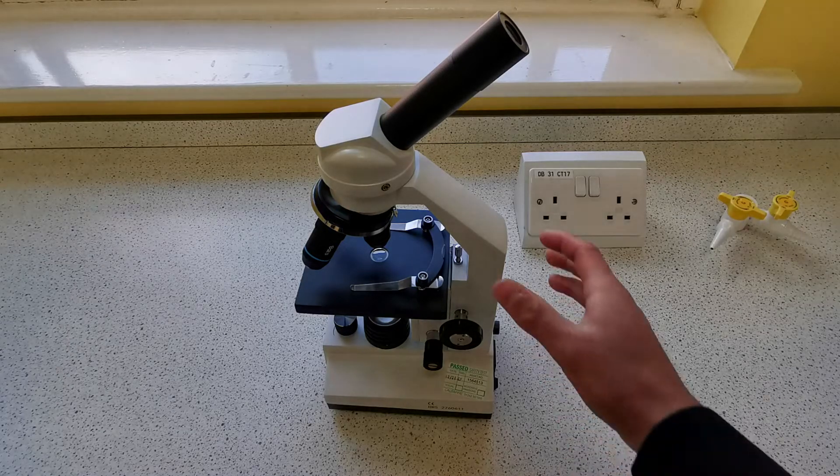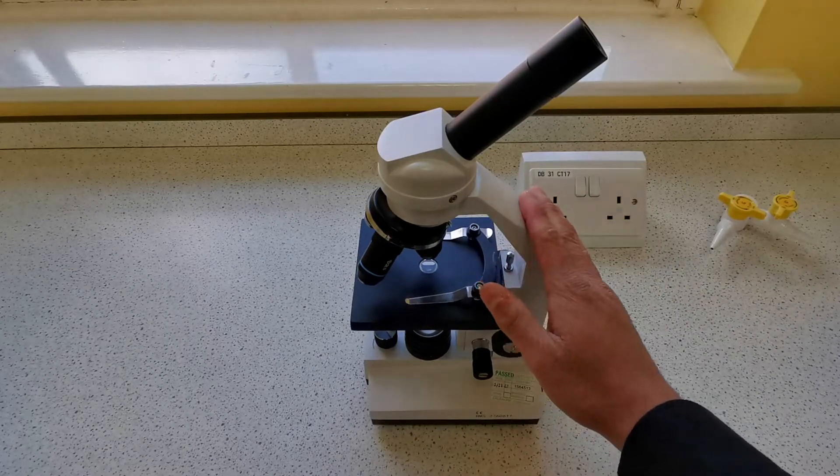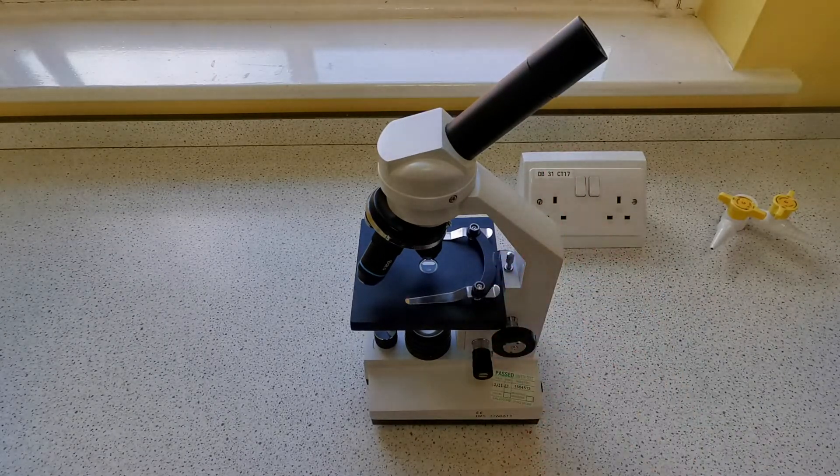Today we're going to be looking at the light microscope and how to use it, what the parts are called, and how to prepare a slide to observe onion cells.